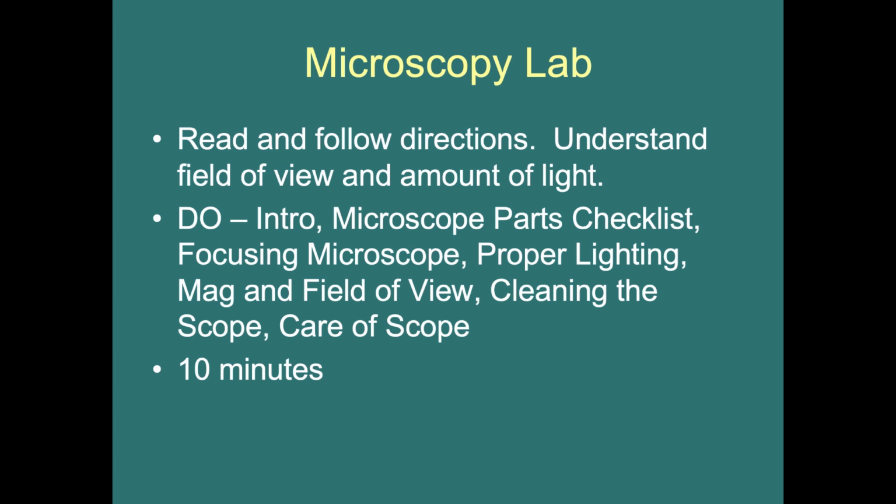Your field of view is getting smaller, and the amount of light that's coming through is also getting smaller. Okay. Make sure you go over your microscope parts checklist. Make sure you know how to focus the microscope, work with the lighting, and again, when you're in your labs, make sure you're taking care to clean the scope.